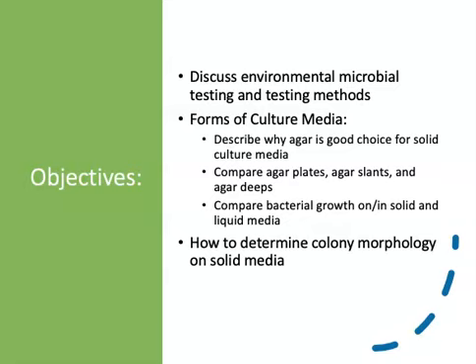Our objectives for today are first to discuss the kinds of methods that we use when we test certain environments for the presence of microbes. We'll discuss different types of culture media today. We'll talk about why agar, for example, is a good choice as a solid culture media.